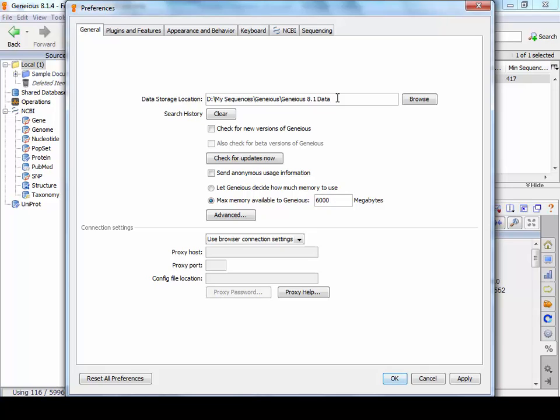But you can also use a data share that you set up with computing services. People with a lot of data may want to do this because you can have a lot more space and it's also backed up regularly. Whereas on the D drive, if the computer crashes and dies, you lose all your data. So we recommend that if you're using a lot of data, go with a data share and ask the computer services for that. And then you just change the location here.